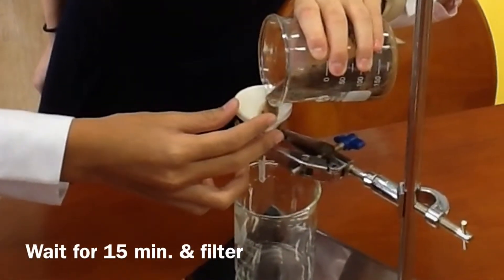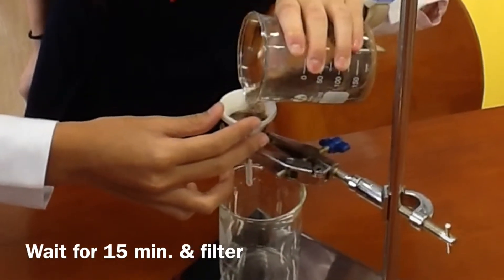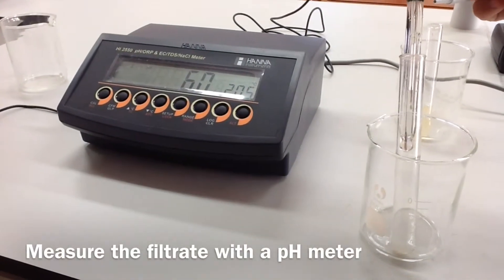Wait for 15 minutes and filter. Measure the filtrate with a pH meter.